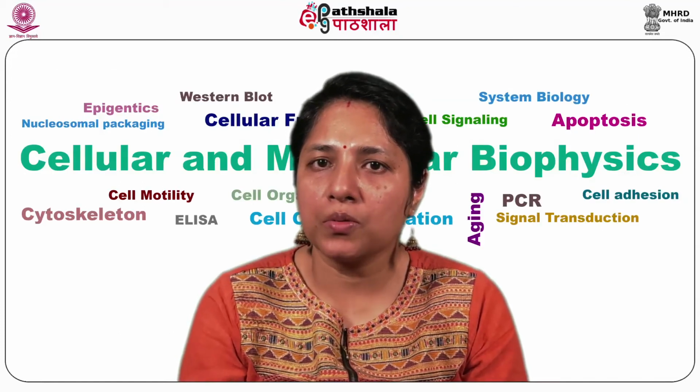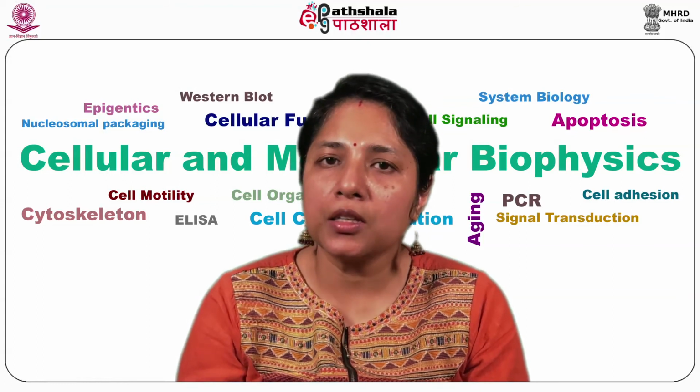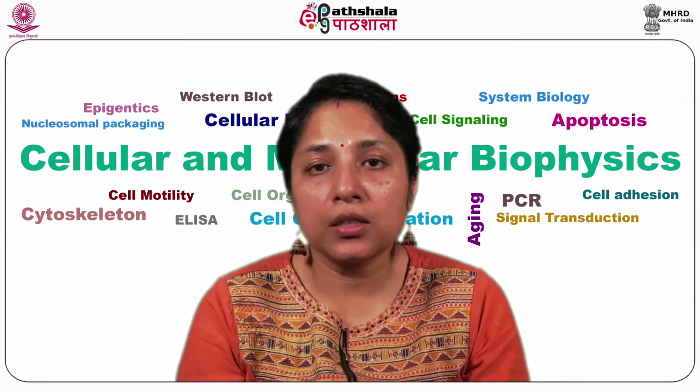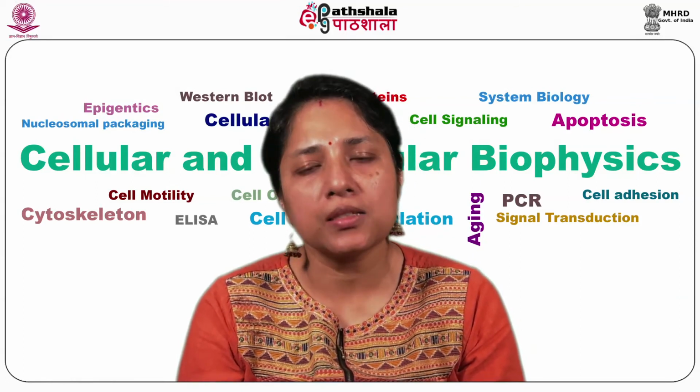These studies include observation of the behavior of cells and cell components in a centrifugal field. It helps in determination of the mechanical properties of the cell surface and cytoplasm.